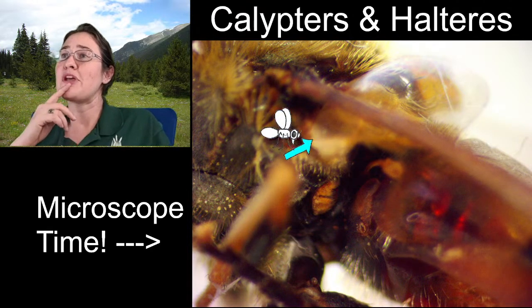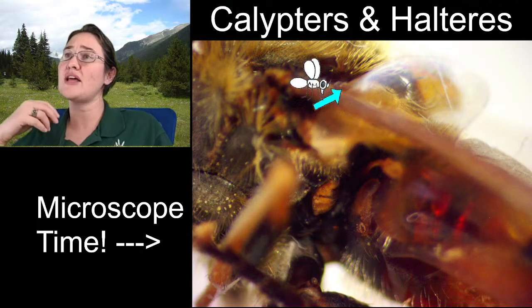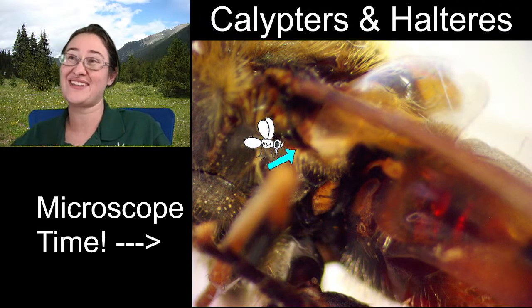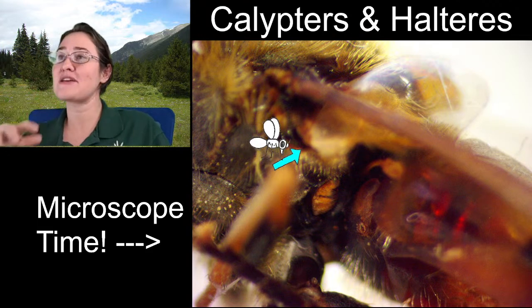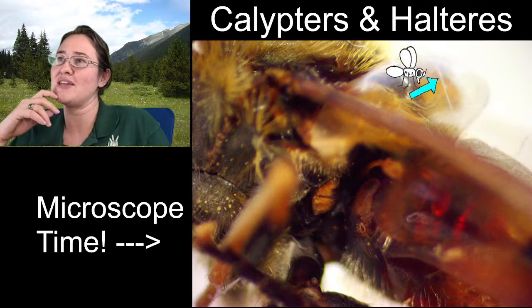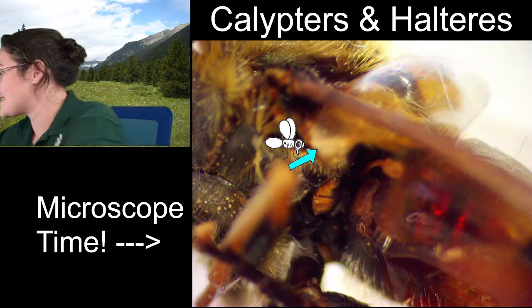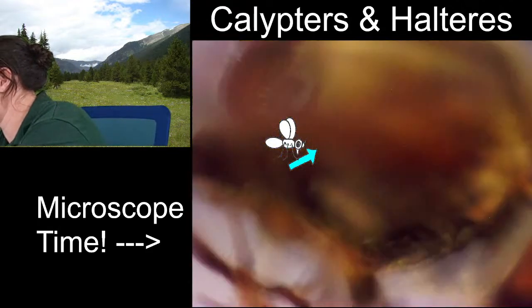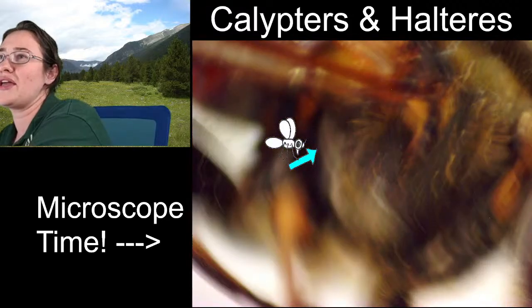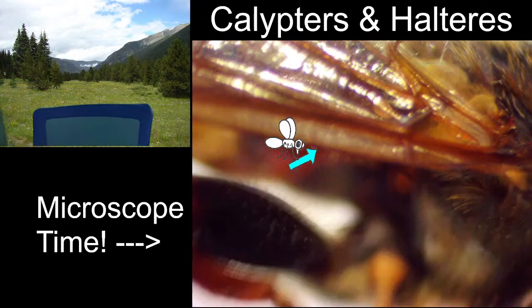Now, the calyptors only some flies have, and these are like little pads that generally cover the halteres so you can't see them. I think that on this specimen, I can see the halteres just because his calyptor is moved out of the way. It's right here. It looks like a little flap of wing, but it's not a piece of the wing. It's actually on its body. I can show you on this side, the calyptor is in the way, so I wasn't able to show you the halter on this side.